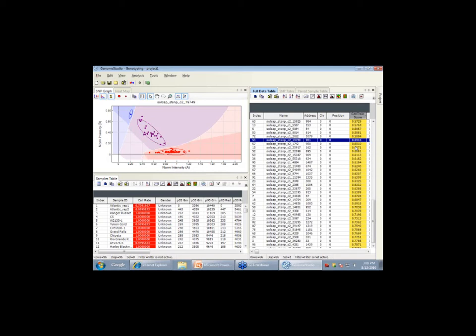So the question is, is the number of SNPs quite limited across species? I don't know about the number, but the actual position is conserved. The SNPs are conserved. As long as the sequence aligns and it's not an insertion or deletion, there has to be an allele at that place, right? Is it a new allele or not? If it's actually a C where we've only interrogated an A and a T in the SNP, the assay won't work, because the assay was designed for an A and a T. It wasn't trying to interrogate a C. So if you actually have a C in your wild species at that space, it'll be a missing data point. So it's limited to the assay.